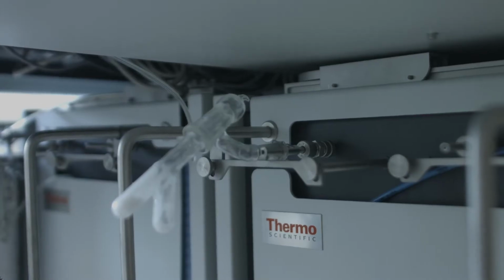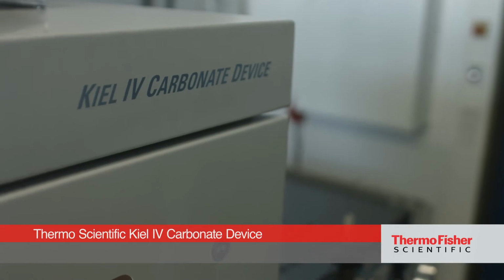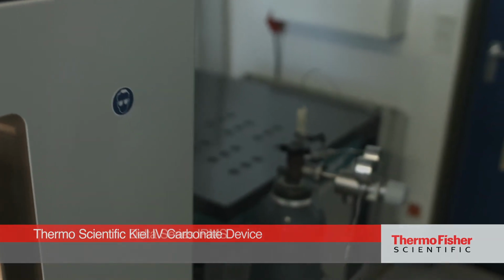For the measurement of the carbon isotope composition of carbonates, we use a Kiel device, a Kiel 4 device, in combination with the Delta Plus mass spectrometer for conventional delta 13C and delta 18O measurements of carbonates.